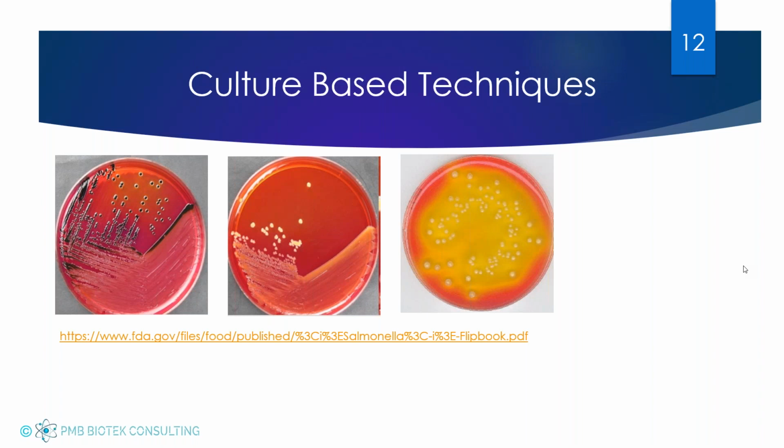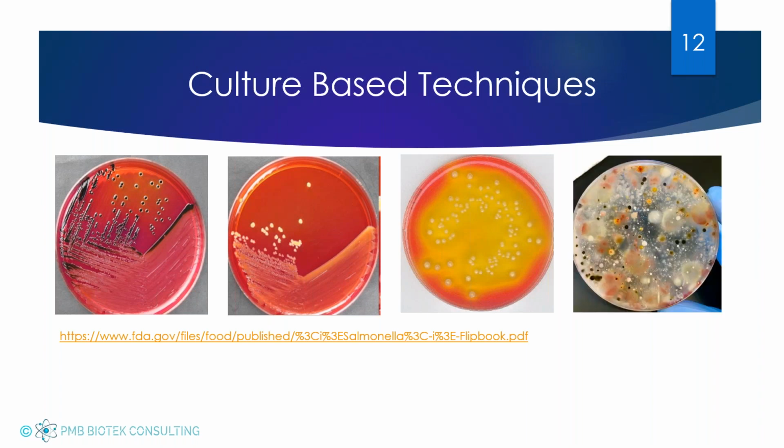And then you start talking about traditional plate counting methods, and you can get plates like this where you have a whole host of a mess on that plate, and enumerating what's fungal growth and what's bacterial growth can be quite cumbersome, and in this case, virtually impossible. So that's why, as a consultant working with technology providers and the government, we tried to move away from culture-based techniques.